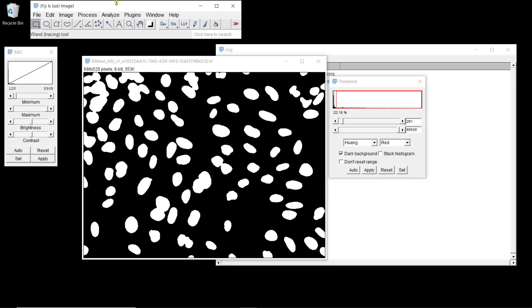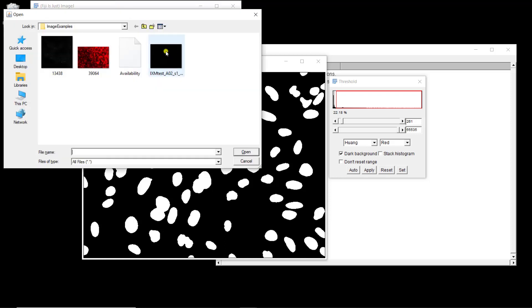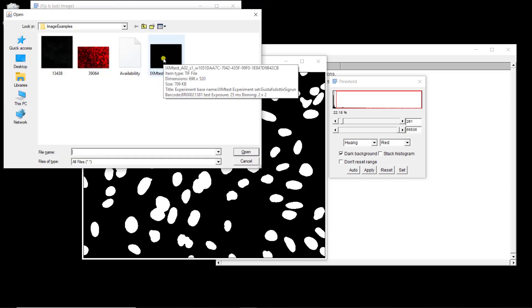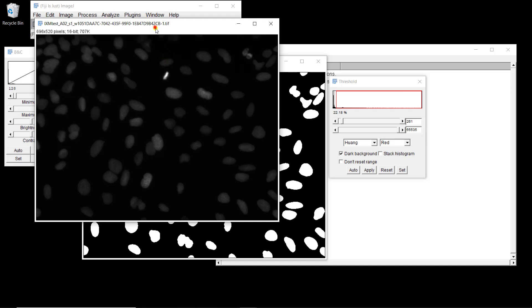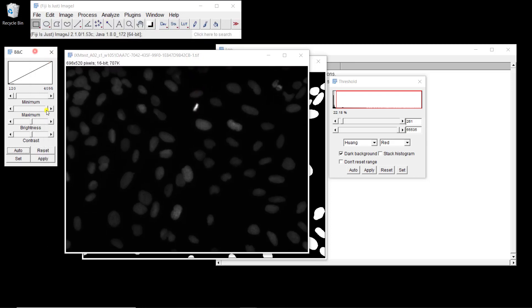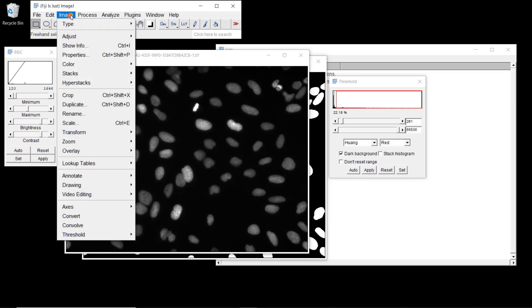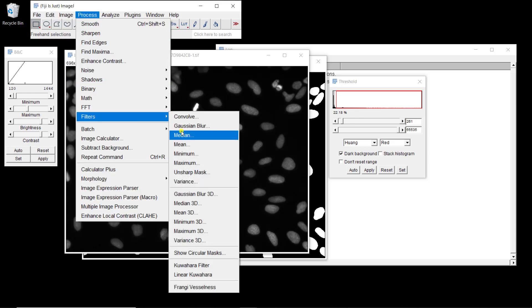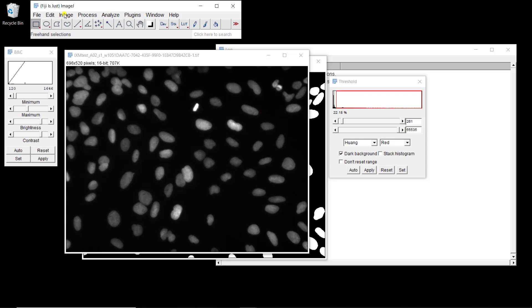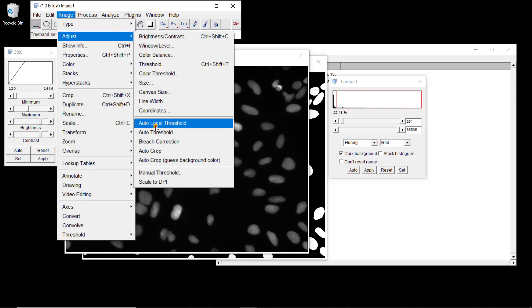Now, instead of a global threshold — where we estimate one threshold and all pixels with an intensity above it are part of the object component, and all below are part of the background — you can estimate a local threshold. With local thresholding, the threshold depends on the location in the image. So let's filter the image again: Process > Filters > Median. And now you have a similar option, which is Auto Local Threshold.